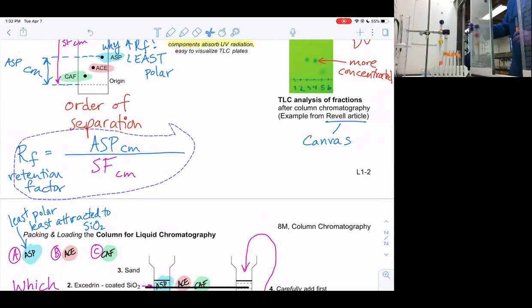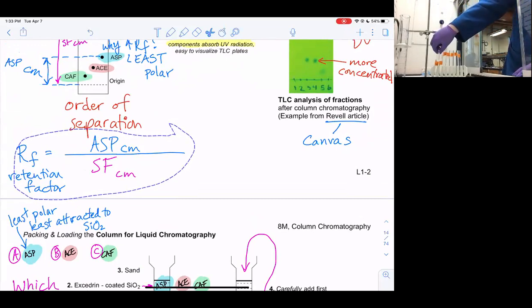Someone had asked earlier how you can tell whether we have 15 mLs in there. The best way to do that is to take about 15 mLs of DI water and put that into another test tube of the same size. So we may have switched it out slightly early, that's completely okay. We can let the next one run a little longer. This is normally what I do when I'm running stuff, just to give you an actual visual point of where you should stop. You can even take a Sharpie and mark where that is, and pour the water out, so you don't have to keep the test tube with water in it, and you still have that mark. That's all I wanted to add there.